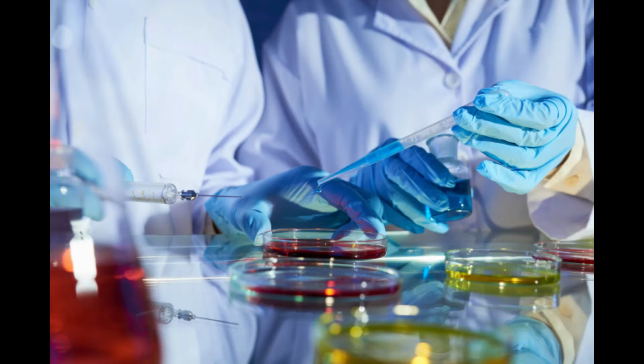I will have y'all some sterile small beakers out here. You're going to come over to the broth in the incubator, and you're going to pour yourself a very tiny amount. You don't need very much. You don't need a full beaker. You need like 1/8 of an inch, right?